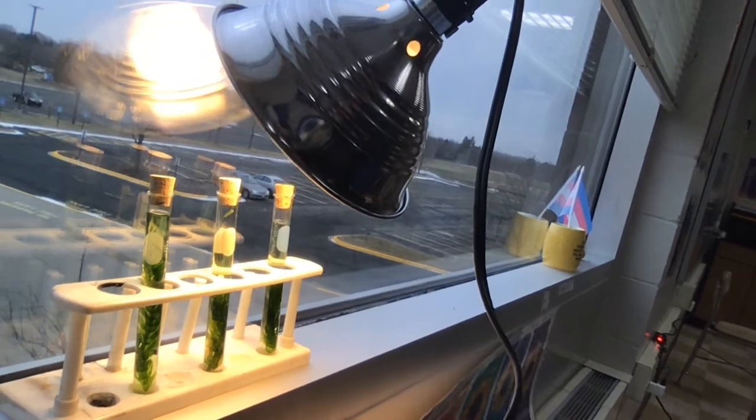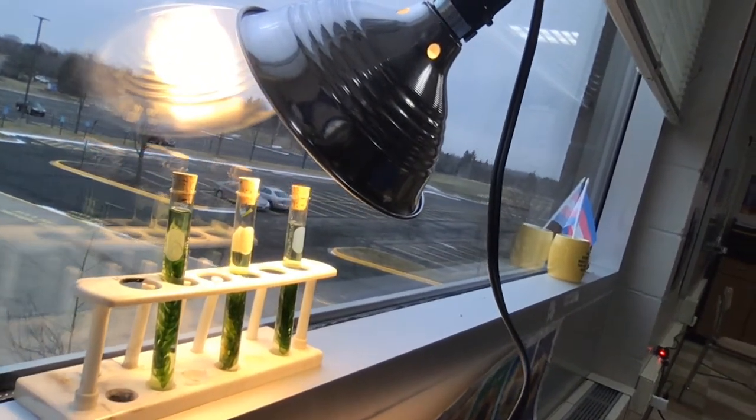I can already see bubbles rising in them. That means that oxygen is being produced. We'll come back a few hours later.